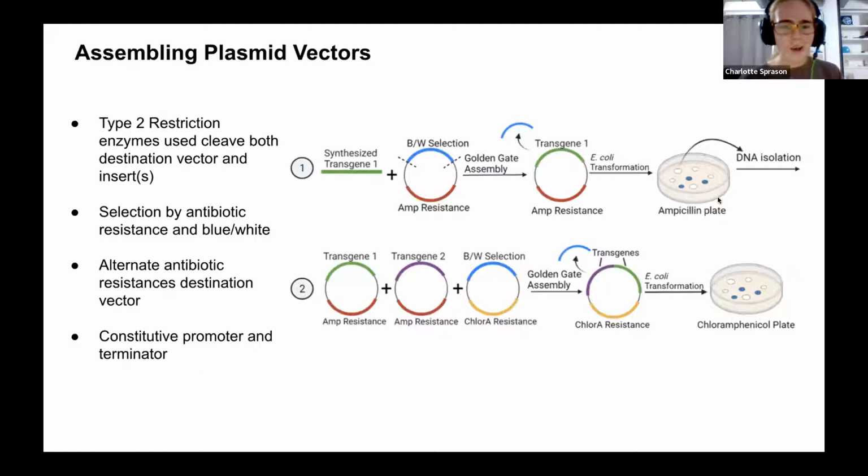Onwards, shall we go? Once we've got our RNAi construct nicely built and our gene, the next step, as Lindsay previously described, is to get them into plasmids with the Golden Gate method, which she explained so fully I probably don't need to explain again. The first step, we stuck our gene and our RNAi into a plasmid. We chose the white colonies, and then we did it again with the promoter and terminator. The only point I'd like to add is that after we put it in the initial plasmid, we sent it off to get sequenced just to make sure that the gene and the RNAi construct we received from Twist DNA were accurate and that no base pairs had been lost in the synthesis.